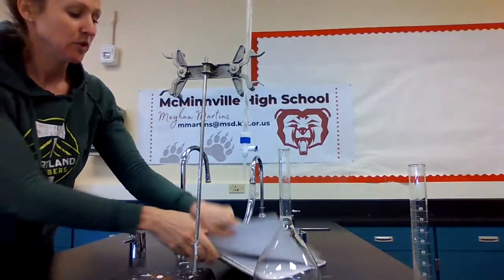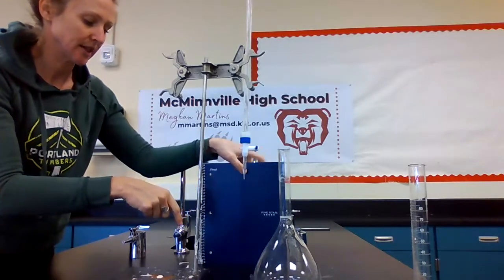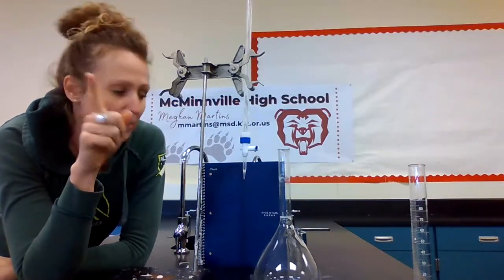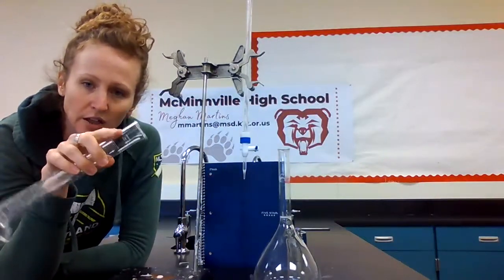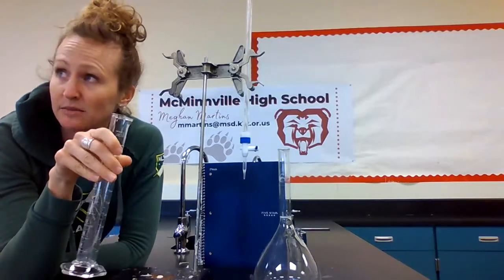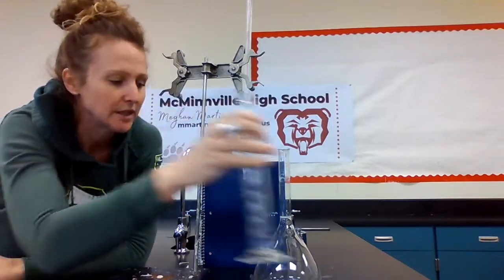The other thing with a burette is you can add volumes together, add solutions together, and you can add solutions together drop by drop by drop. Now, if I was going to try and do that with a graduated cylinder, first of all, I probably wouldn't be very good at pouring out just one drop. If I did somehow, and for some reason master that skill, my drops would probably not be very uniform. And those are things that a burette is good at also.